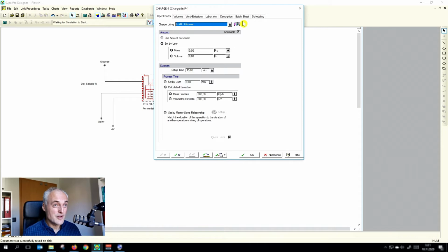If you would have done the calculation, you know that we do that in 1,500 liters equal kilograms, and then to produce the amount of yeast we want, we need 50 kilograms glucose. It's a very wise idea to redo this calculation.